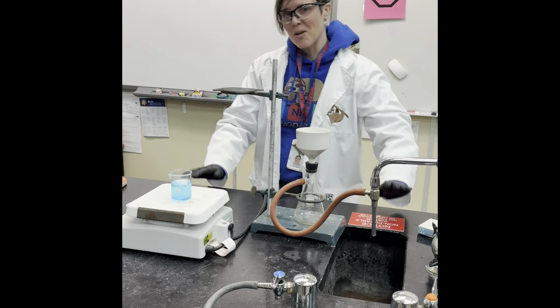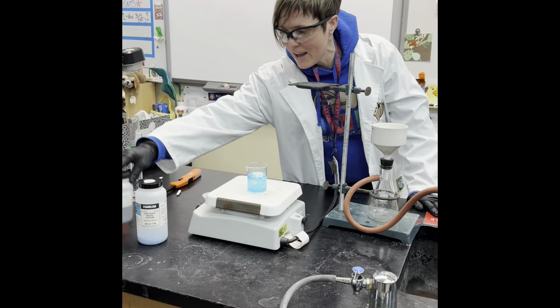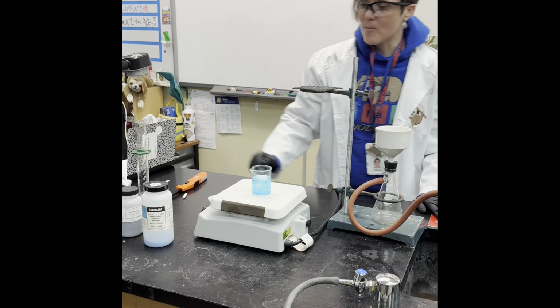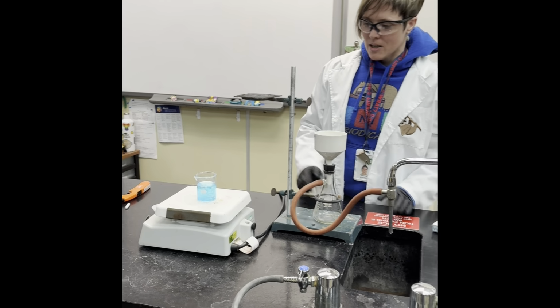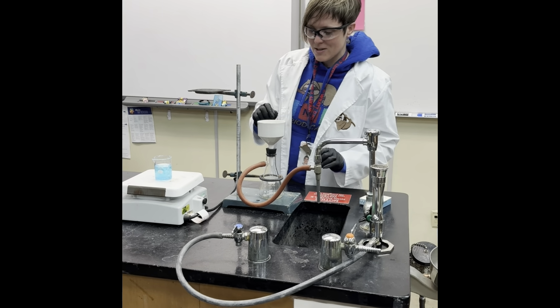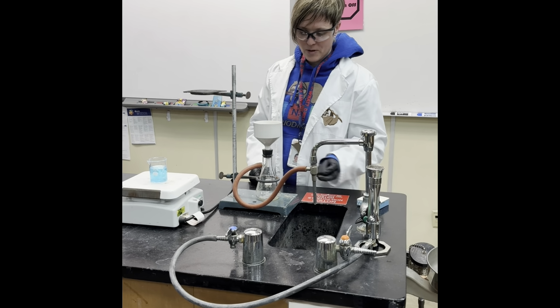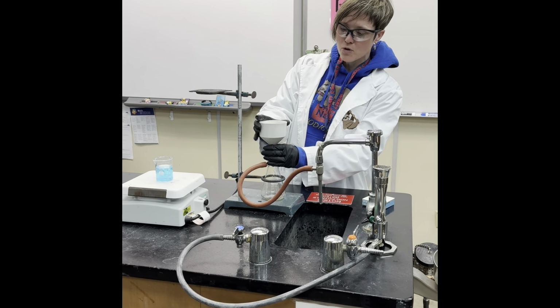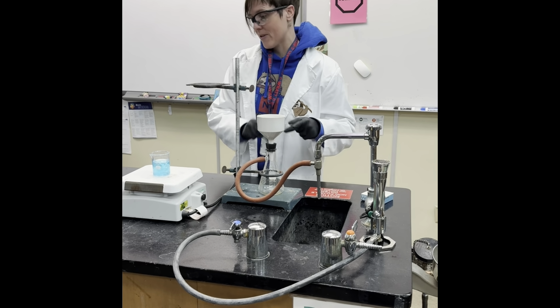So you can think about what type of reaction that is when we're starting with copper(II) sulfate and iron, and we're ending up with copper and iron sulfate, okay? Because of that, it's kind of a solid, but it's a little wet. So we're going to use this apparatus, which is a vacuum filter, attached to a Buchner funnel. And so I'm going to filter off the solid.